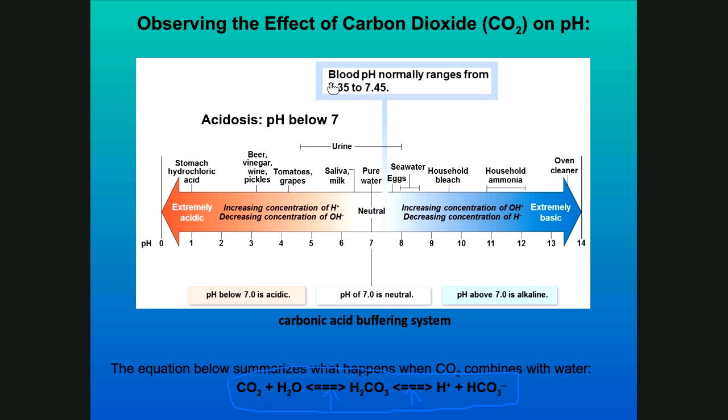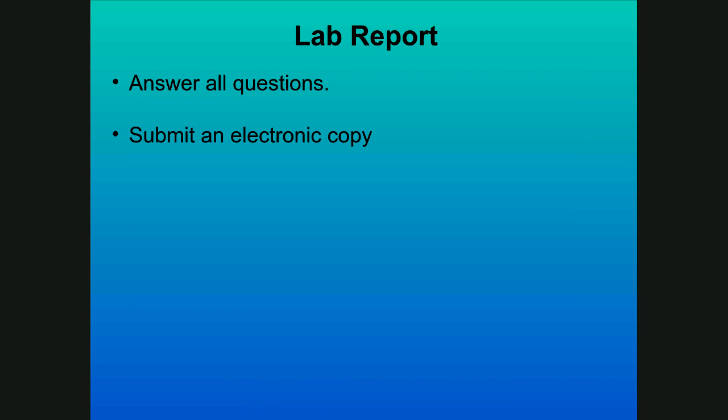In the lab you've been given, it's going to give you a scenario. In this scenario, I'm going to use the last slide. They're going to say, we're going to give you a beaker. I know this is an ugly beaker. We're going to give you a beaker of water. And then what you're going to do through a straw is introduce carbon dioxide into that water. You have a straw and you're going to exhale into the water.